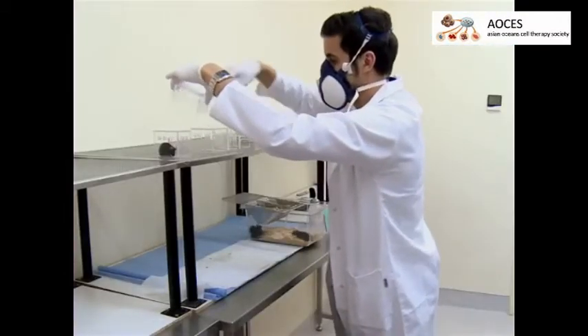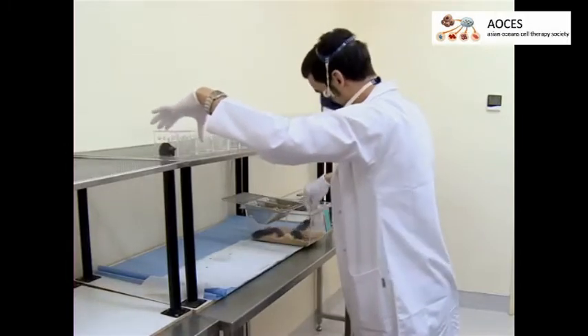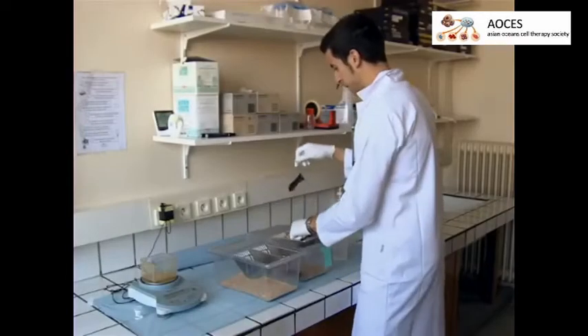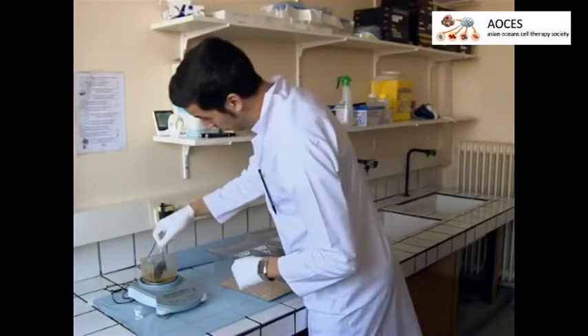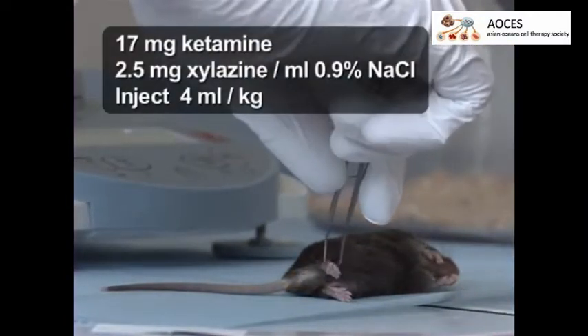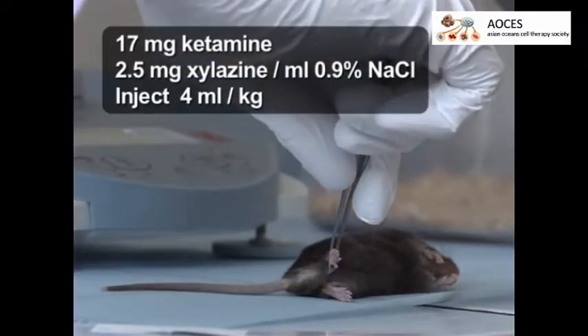The paw withdrawal threshold is the lower of the two gram values for a given mouse. These values may differ between both paws. Repeat this procedure daily until at least three consecutive threshold values are stable, then proceed with the surgery. Record the animal's weight, which should be over 20 grams.